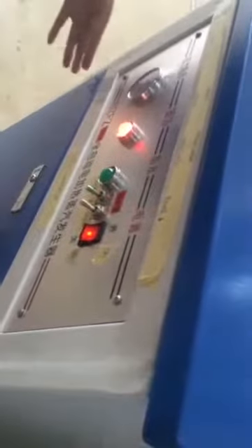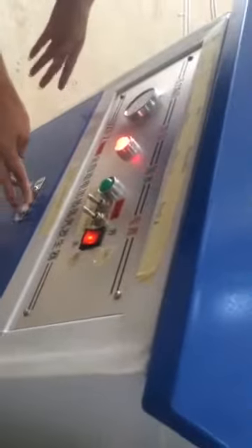Now you can turn on this machine. Press this button — the power button. As there is no water, some problem may happen.